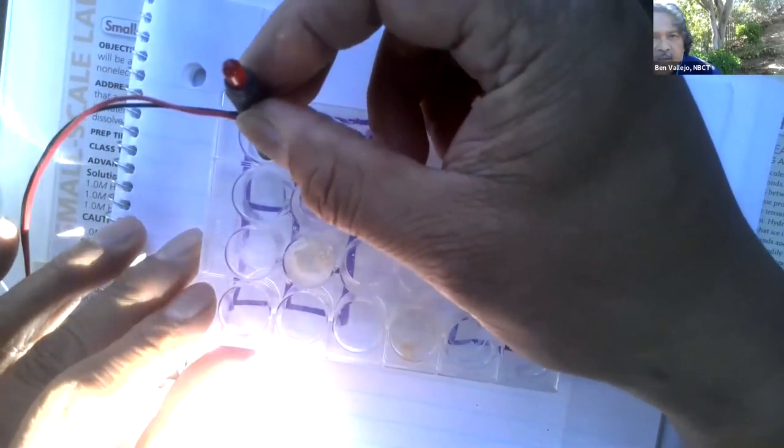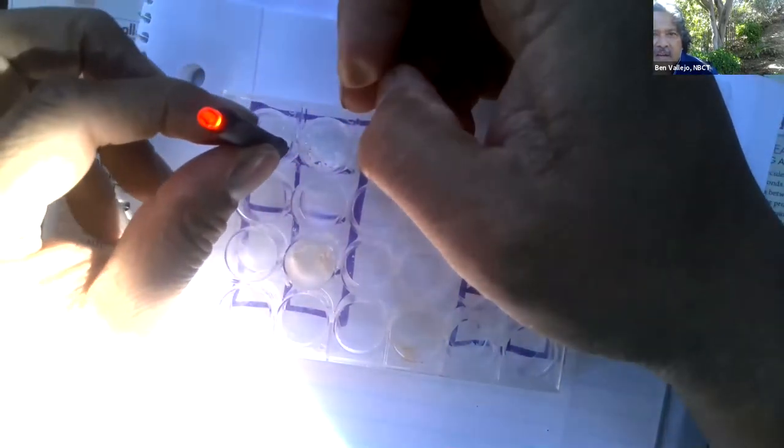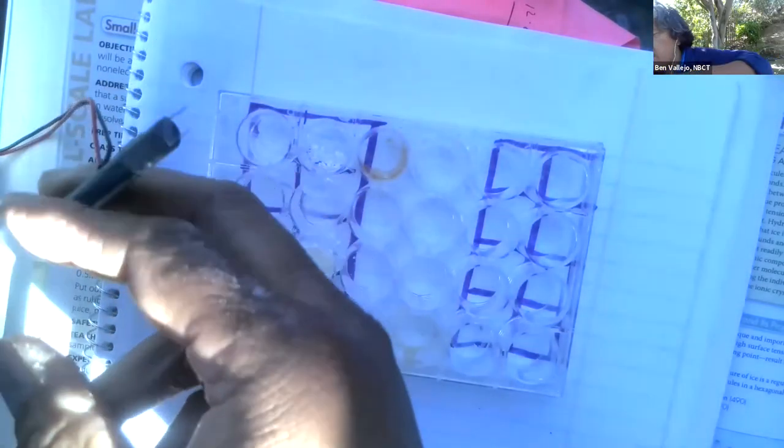Let's try salt, NaCl. Watch the light right here. Yep. Okay, so that works. So that's pretty cool. All right, let me get a washing beaker. Get some water and wash this off.